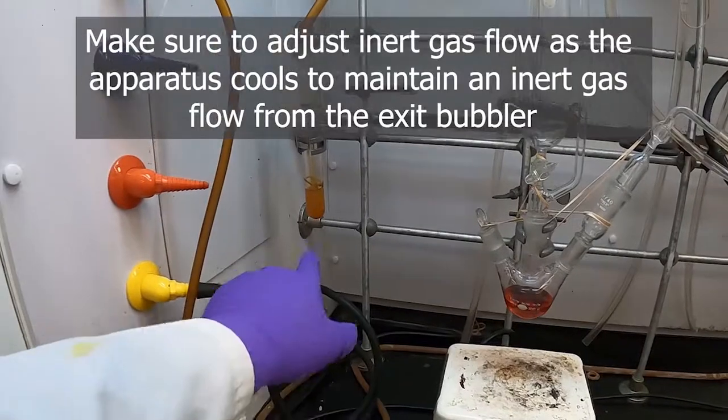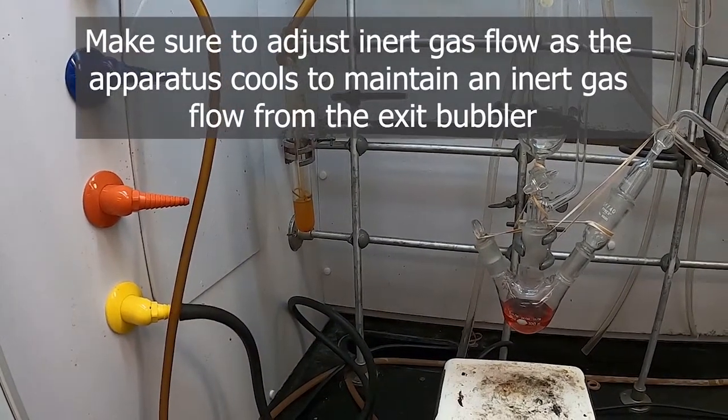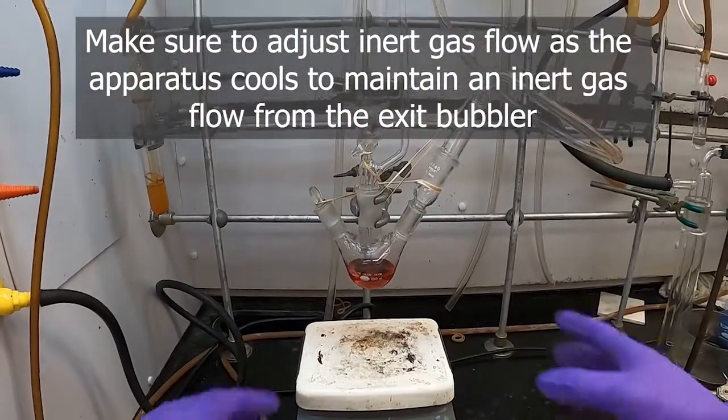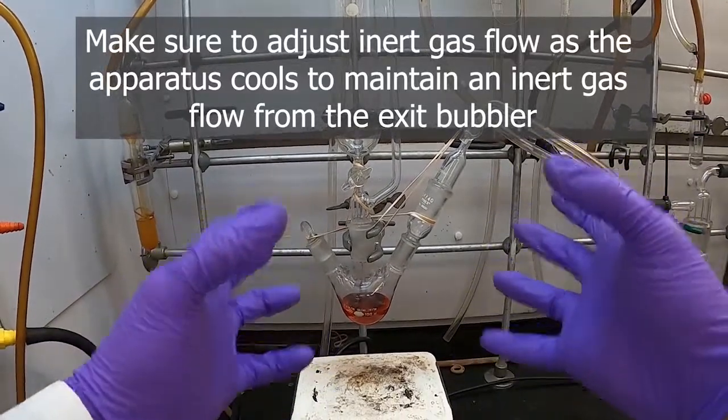So I've started the nitrogen, and we can see here on our bubbler the bubbles moving through. It's a pretty good rate, and that should help prevent any air from getting into our system as it cools down.